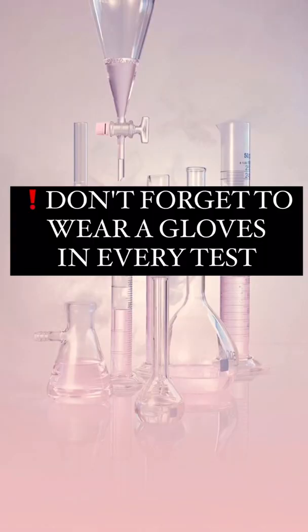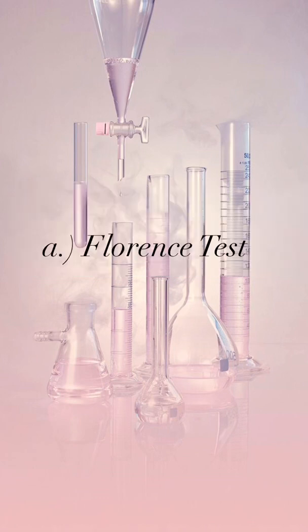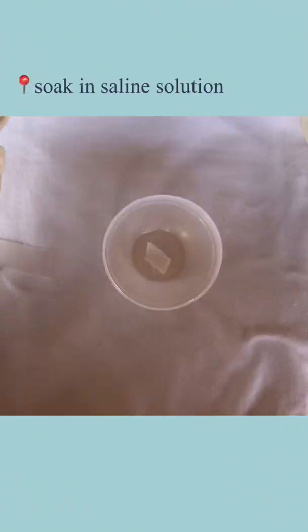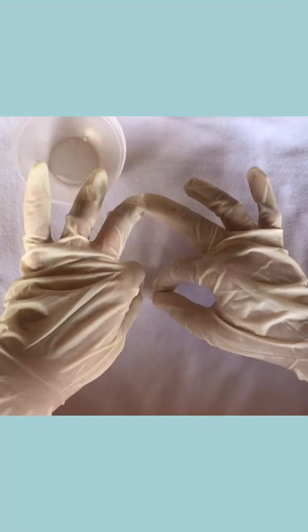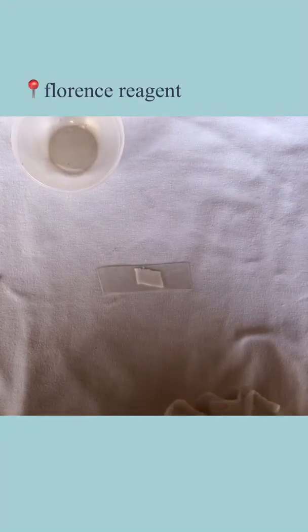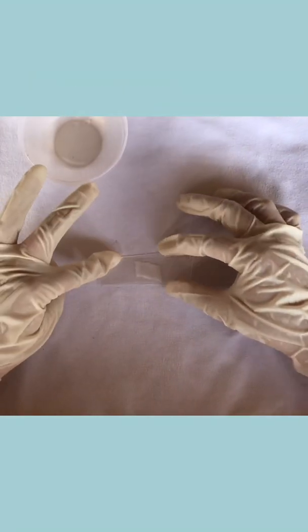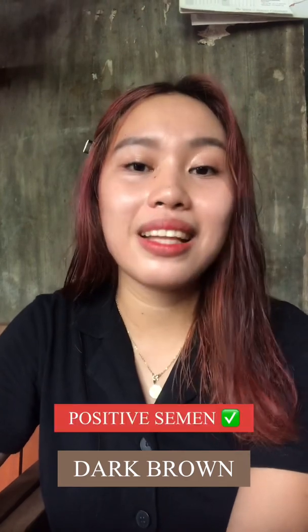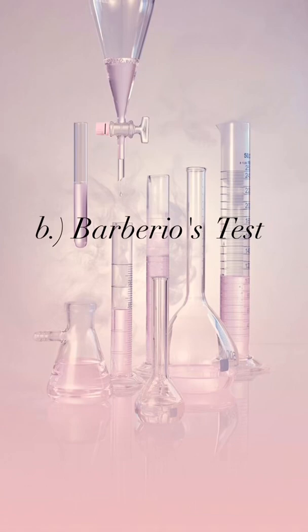The second examination is the chemical examination. First, we will do the Florence test: cut a portion of the seminal stain and soak in saline solution, transfer to a slide and evaporate the fluid, add a drop of Florence Reagent and cover with a cover slip, then examine under the microscope. The result shows crystals of choline periodide which are dark brown, indicating a positive result.